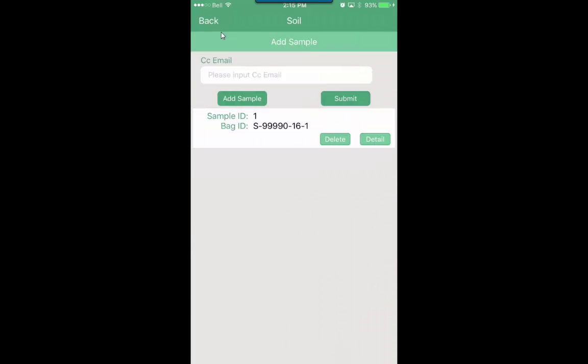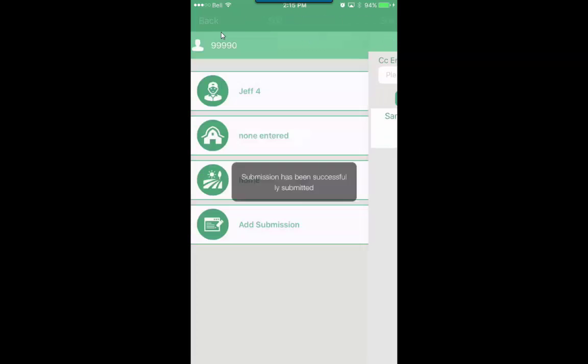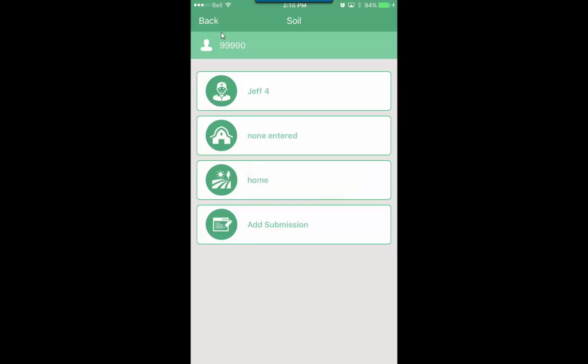So you'll see the one sample there. Now you can go add another sample until the submission is complete. And then once the submission is complete you'll hit the submit button, and then we'll say finalize submission. Yes. So that submission was successfully submitted.